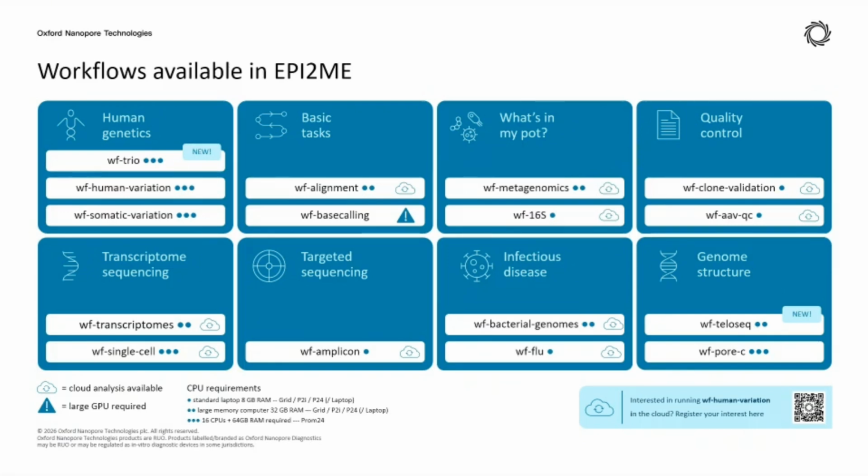Normally for sequencing, if you want to perform haplotyping or phasing, that means from one single individual, we want to know whether the variants or the alleles are coming from one parent, or whether they are actually carried from different parents. So normally we will need to do some phasing. The normal way of doing the phasing is we sequence the parents and the offspring. Then we can tell which variants are inherited from the father and which variants are inherited from the mother.